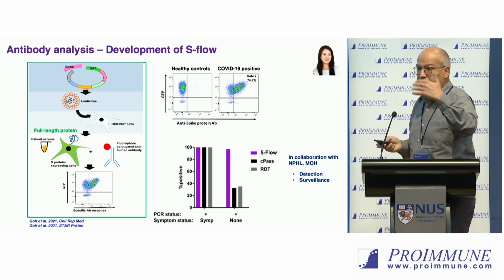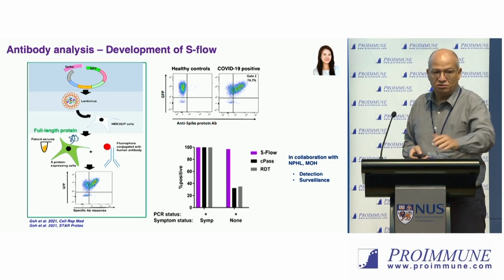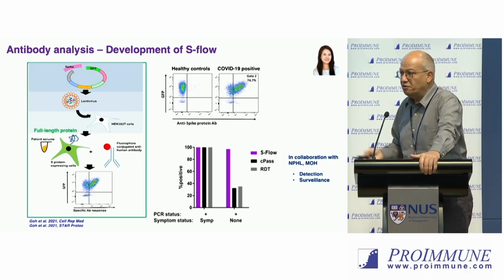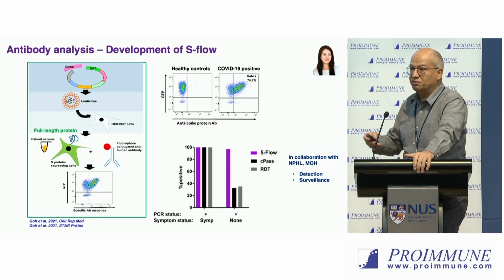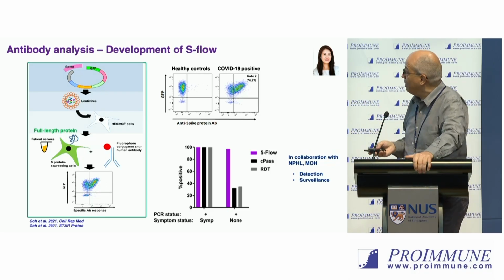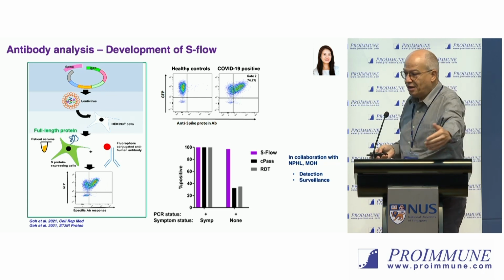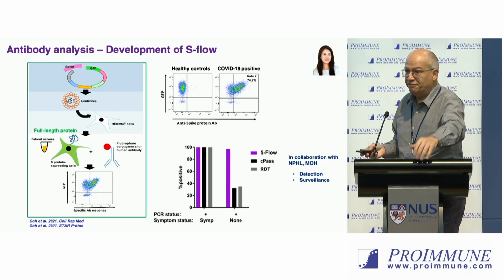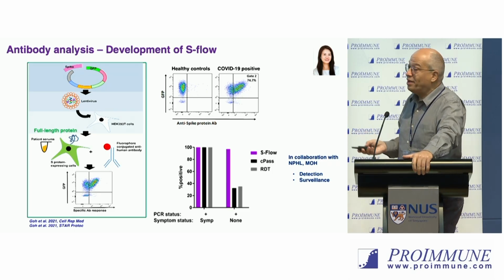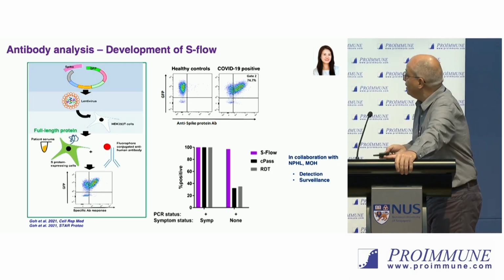And we wanted to use that in a case-control study, where we had, at the beginning, as mentioned by Dell, in January, people who were isolated. We could also look at the close contacts, and we wanted to evaluate with NPHL, the National Public Health Laboratory, if these people who were exposed to infected patients were also possibly infected. And so we compared different assays. We had the beginning of RDT at that time. We had the CPAS developed by Professor Wang Lingfa and Tan Chiwa.